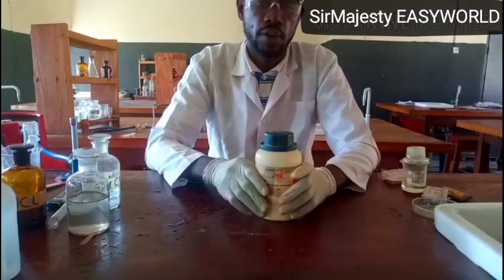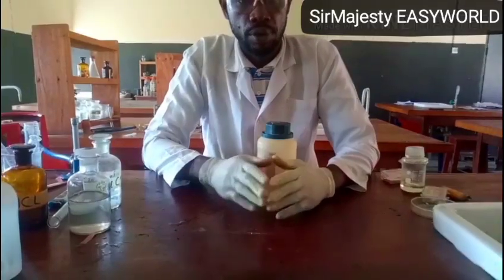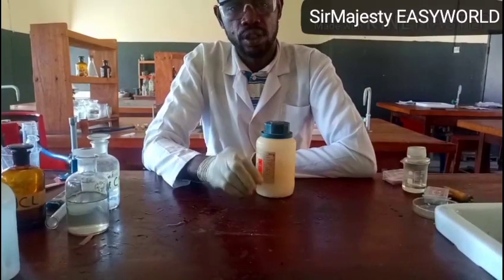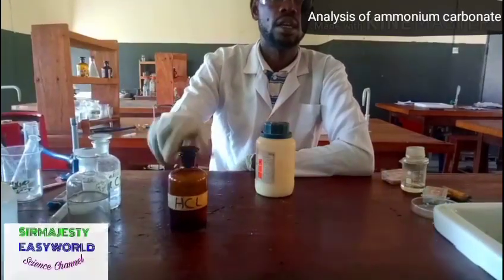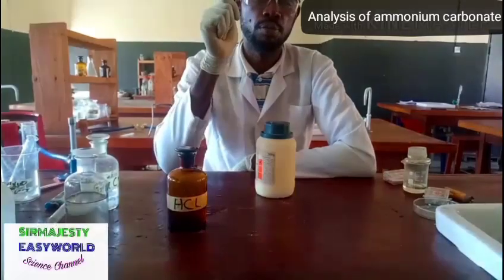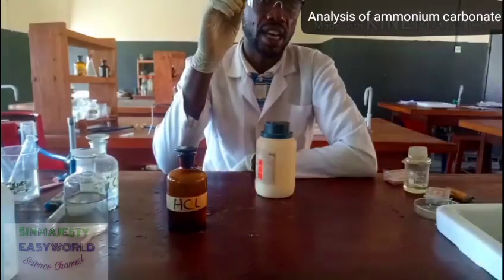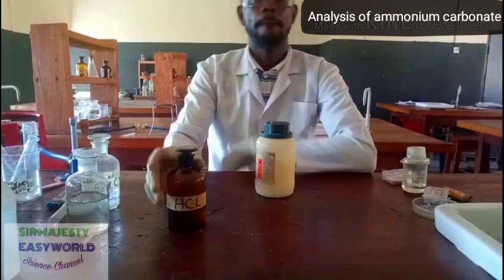And also, please, lest I forget, carbon(IV) oxide will also have an effect on litmus paper, but it will not turn red to blue; rather it will turn blue to red, because carbon(IV) oxide is an acid anhydride. So in your report, when I treated the sample with dilute HCl, it liberated CO2. You can also tell the examiner that the gas turned moist blue litmus paper red. In your inference, the gas is acidic. But the thing that is so specific to CO2 is the ability to turn lime water milky. That's the only gas that will turn lime water milky.